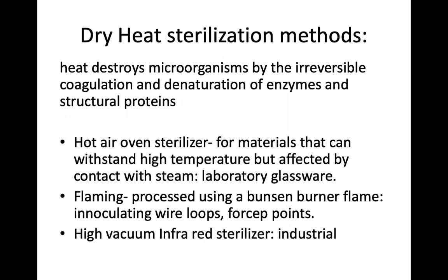Just to point out some examples, heat is a common method, and this method is very, very convenient to use, especially in a laboratory setup, where you're sterilizing different gadgets as you process clinical specimens, and also sterilizing different items that you're using in the laboratory. For example, laboratory glassware, wire loops, forceps points, where you use the red heat, okay? You put the item in the flame, the heat will heat up the wire loop, for example. You're going to see it's going to turn red hot, and any microorganism that could have been present on the item will be killed.